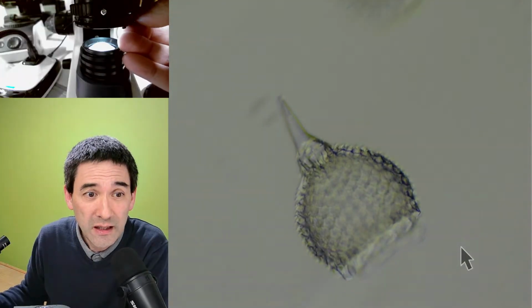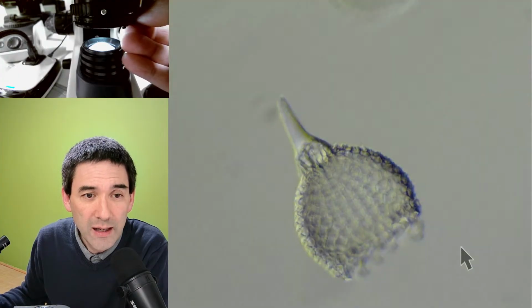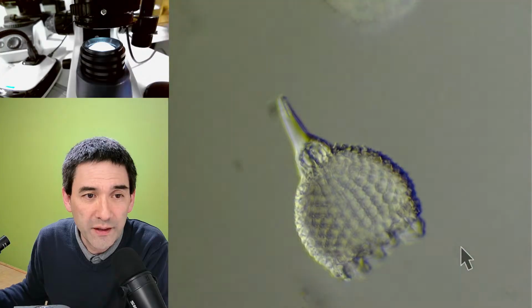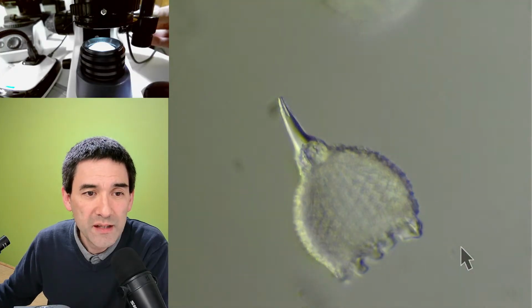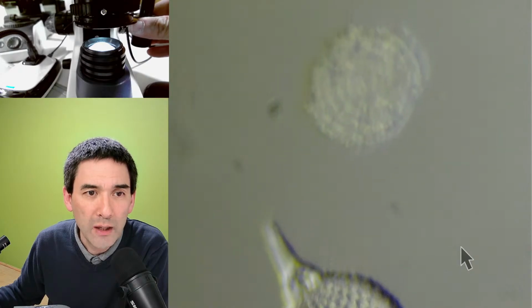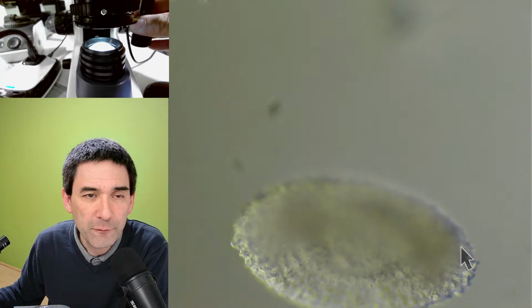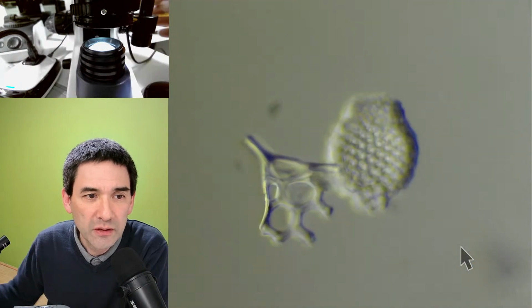Okay, and I found that if you use the white filter, you actually have more control over the whole thing. So this is something I would recommend: not to completely block out the light, but to try different so-called color densities.